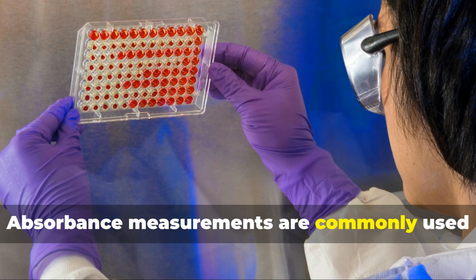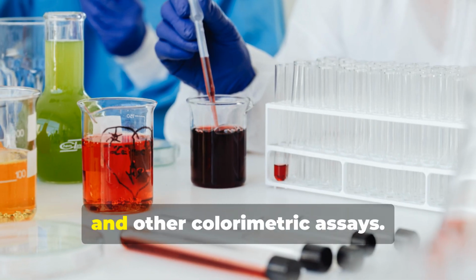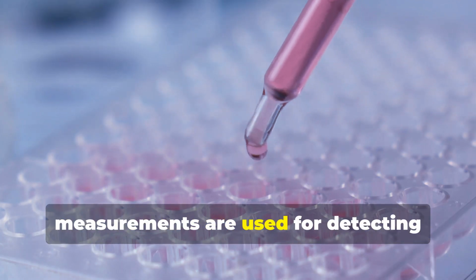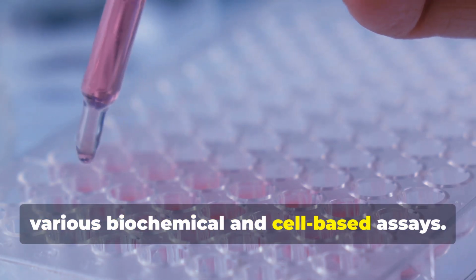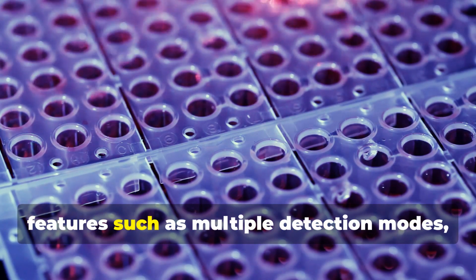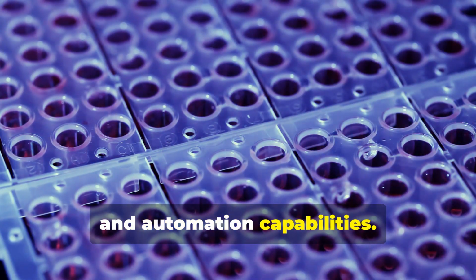Absorbance measurements are commonly used for enzyme-linked immunosorbent assays, or ELISAs, and other colorimetric assays. Fluorescence and luminescence measurements are used for detecting fluorescent and luminescent markers in various biochemical and cell-based assays. Modern microplate readers offer advanced features such as multiple detection modes, temperature control, and automation capabilities.